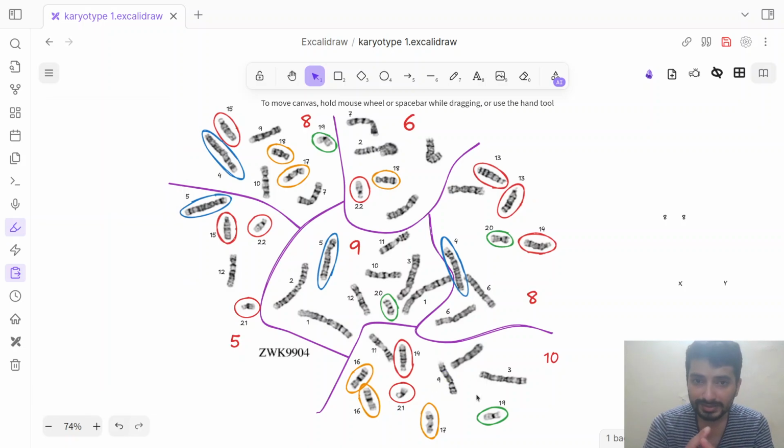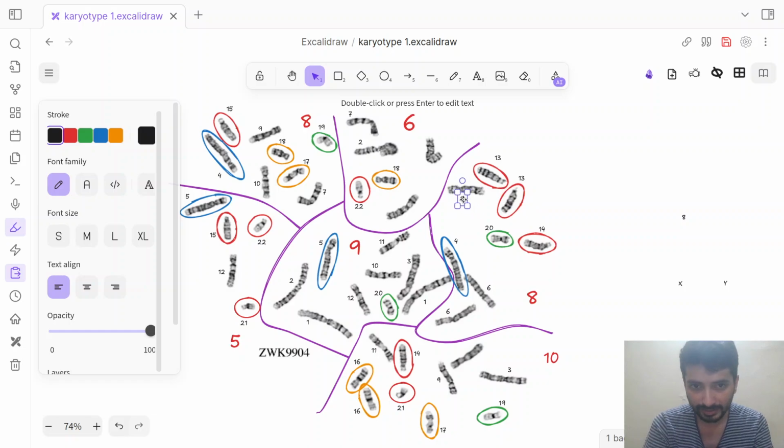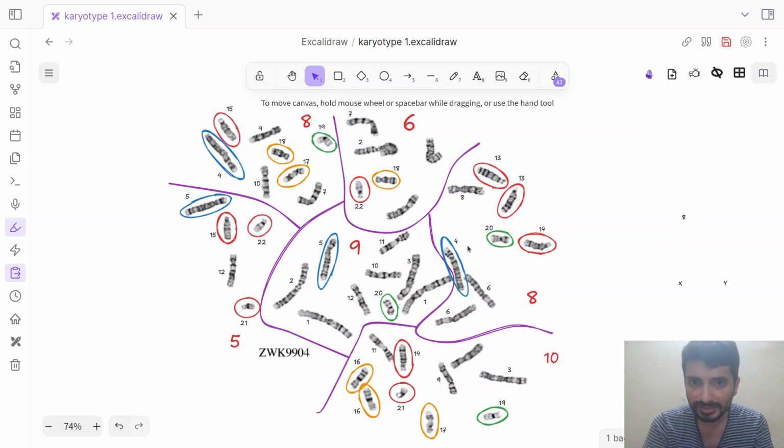Now chromosome 8 is also something like chromosome 9, but usually the P arm has just one band. So you can see this, there are two dark bands here and just one dark band on the short arm. So this is chromosome 8. So we should be left with just three chromosomes. One is this, which is very weirdly placed, the other is this, and the other is this. So remember, the easiest way to identify chromosome X are these two dark bands.